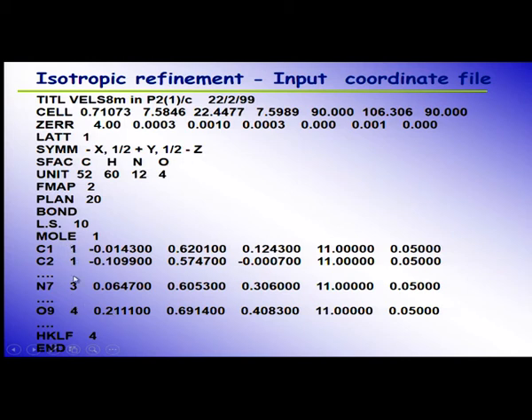So, this is known as the species identifier. According to this number, it finds what the species is and takes the corresponding atomic scattering factor value. Atomic scattering factor of each atom is not a constant and it varies with respect to sin theta over lambda. So, for calculating the structure factor, we need fj at different values of sin theta over lambda, because different HKLs will have different sin theta over lambda. So, your structure factor calculation, that is called mod Fc of a Bragg reflection, needs the atomic species identifier.